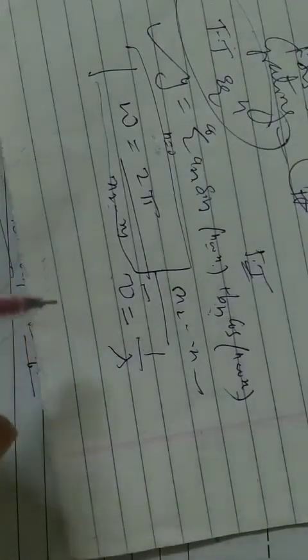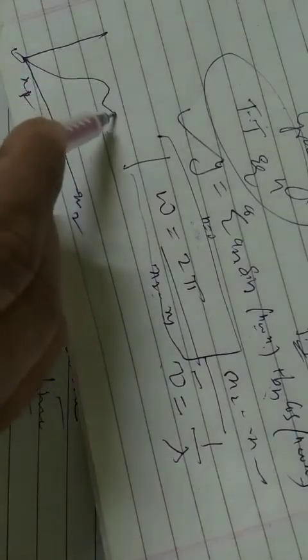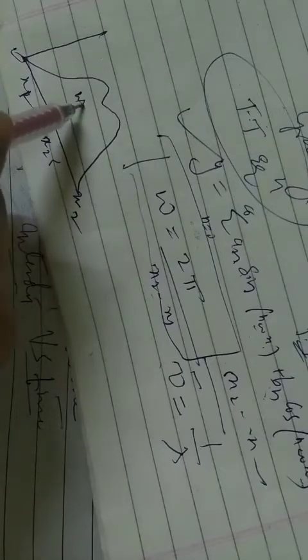And if you see the scale of the x-axis, here is how this omega value helps us. Taking x1 and x2, when x2 is small we get a weak resolution.